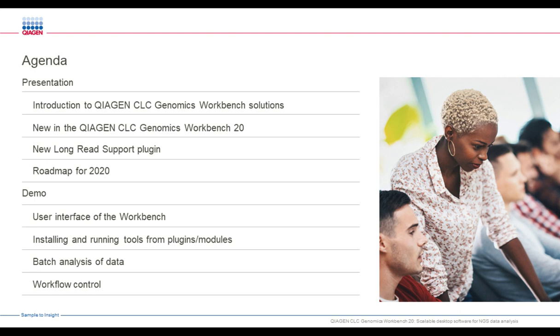I will demo the software for you — how to run it and what the user interface looks like, how to install and run tools from plugins and modules, how to batch analysis if you have many samples, and how to control workflows.